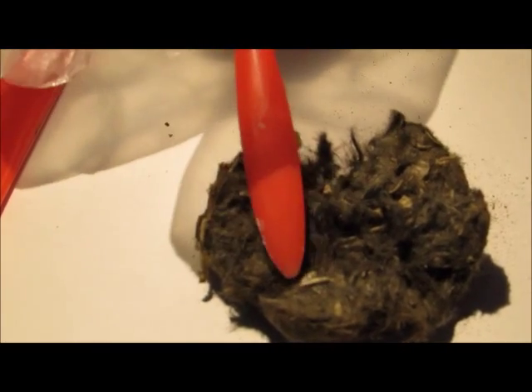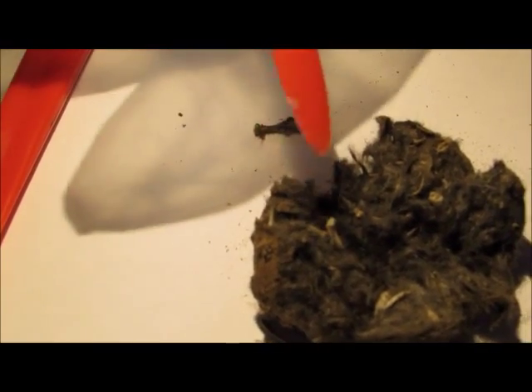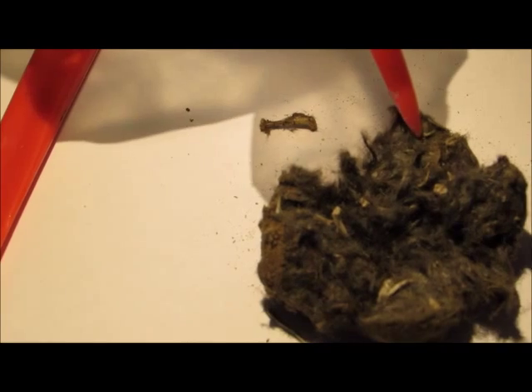I've just opened up the pellet a little bit, and you can see there's loads of feathers in here. On the most interesting point are the bones. You can see here that there's just lots of different bones from different animals, and there's even a skull that I might be able to unearth.